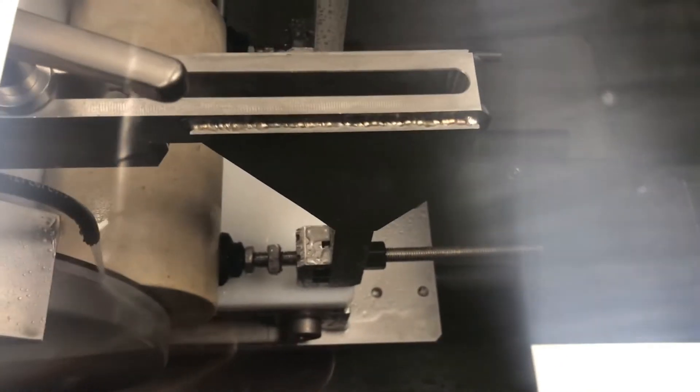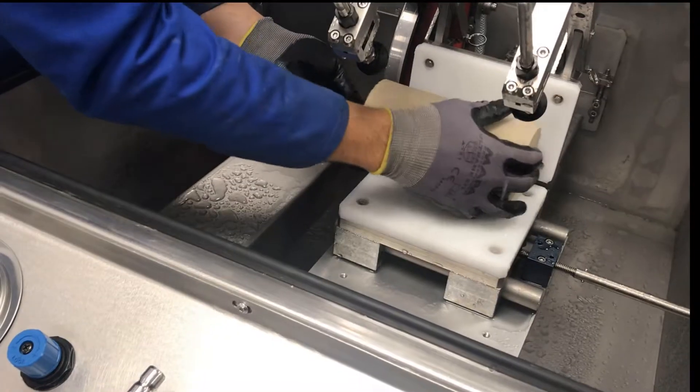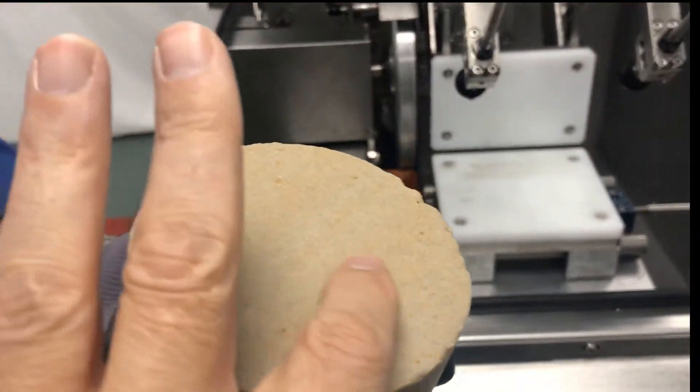A variable rate feed mechanism enables the entire specimen to be processed in a single pass at a preset adjustable speed. The high quality diamond grinding wheel guarantees a perfect smooth finish.